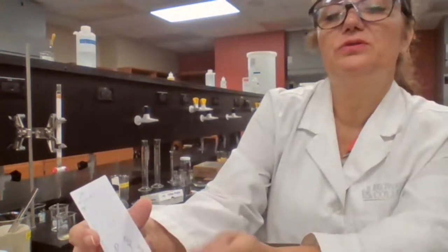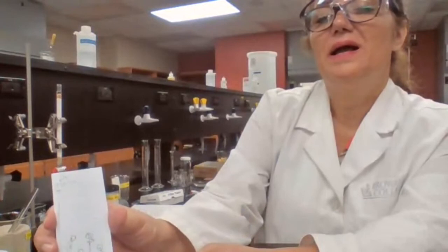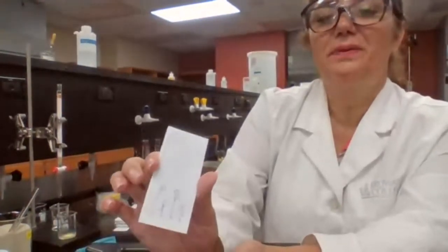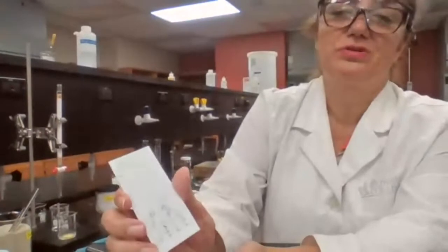For compound 1, which is aspirin, 2.6. Compound 2 is 1.2. Compound 3, 2.8. And compound 4 is 1.2, all in centimeters. And the drawing, you can draw a sketch in your lab notebook, but you don't have the plate, so you can use the picture.